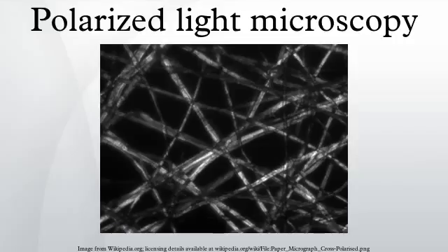The Michel-Levy chart: as polarized light passes through a birefringent sample, the phase difference between the fast and slow directions varies with the thickness and wavelength of light used. The optical path difference is defined as, where T is the thickness of the sample. This then leads to a phase difference between the light passing in the two vibration directions of.